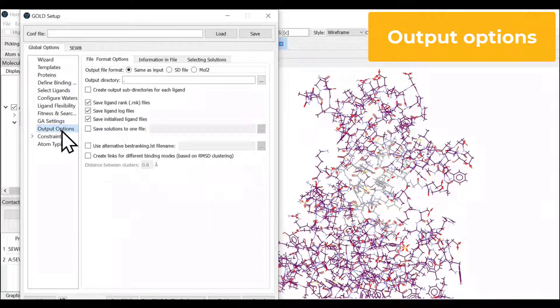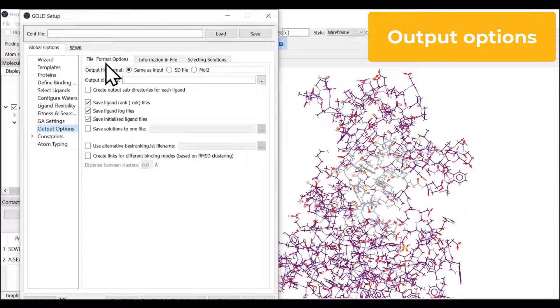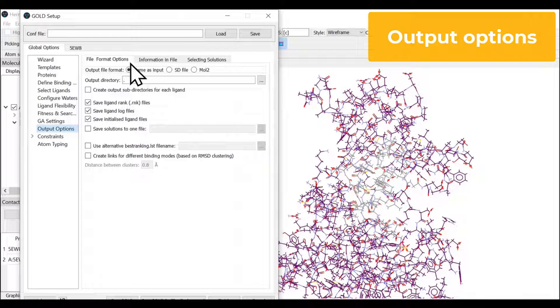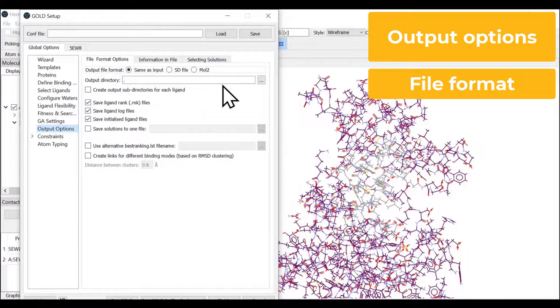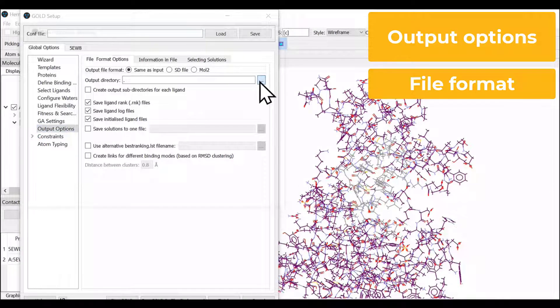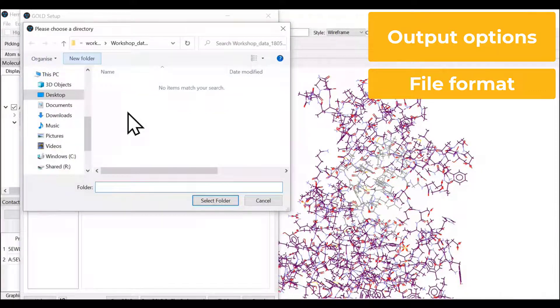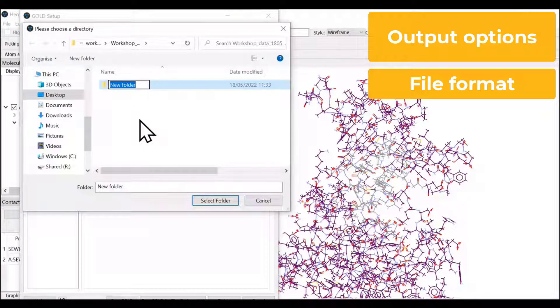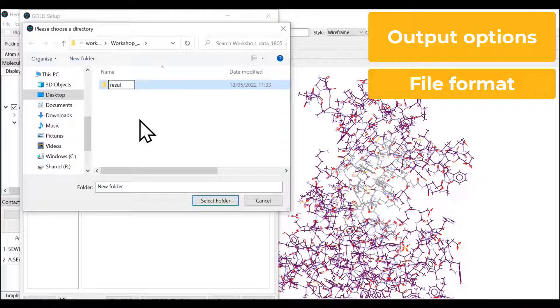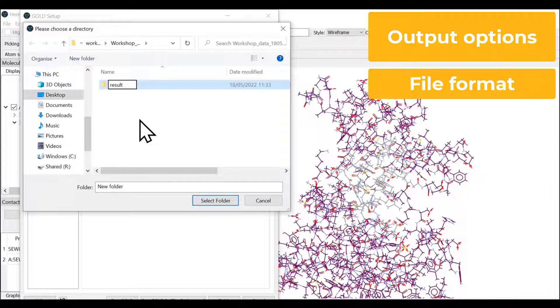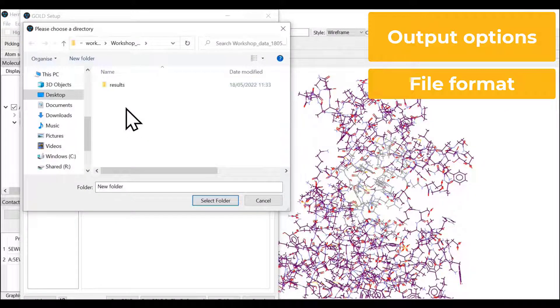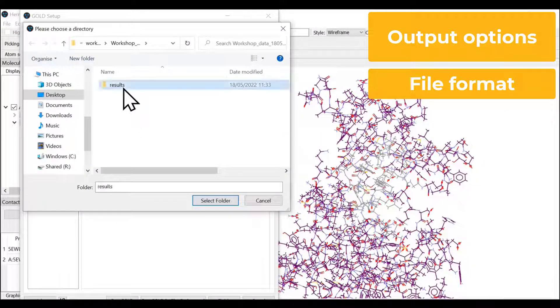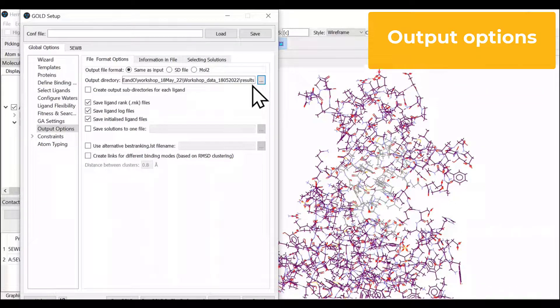The output options. We have three different tabs: file format option, information in the file, and selecting the solutions. This is where you can create a folder or subdirectory into your main working directory for storing the results. We can create a new folder or results folder or subdirectory for storing the results.